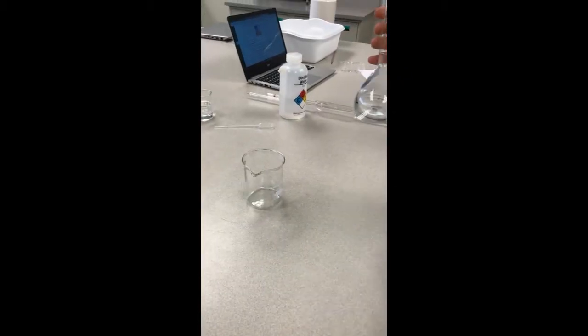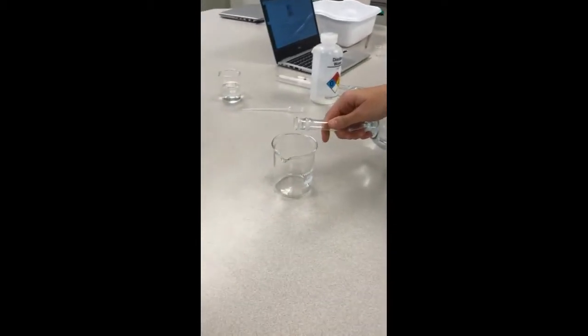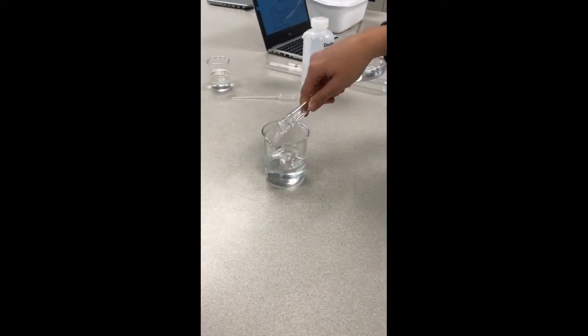Move the 250 milliliter salt water from the volumetric flask to the 250 milliliter beaker, because you don't store anything in the volumetric flask, they're just for mixing.